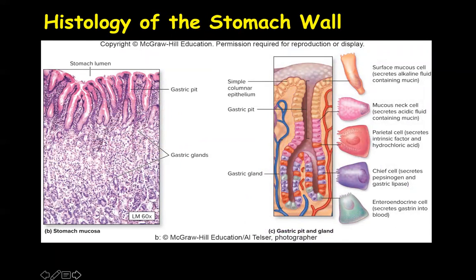Continuing onward through the GI tract, in the stomach, what's unique about the mucosa is it's this simple columnar or cuboidal epithelium that's functioning as a secretory sheet that blankets the epithelium with a protective layer of mucus. And evident across the surface are these shallow depressions that are called gastric pits, and they're lined with mucus gland cells that extend down deep into the lamina propria.